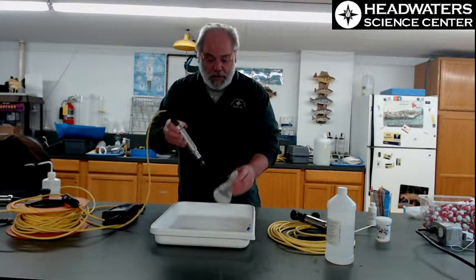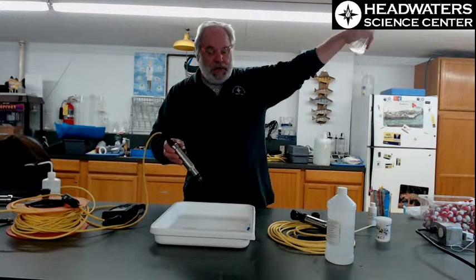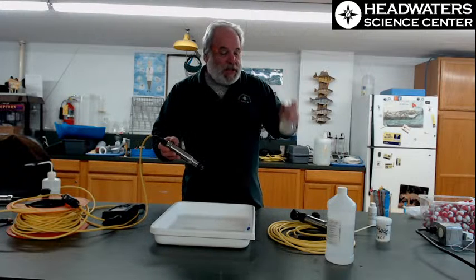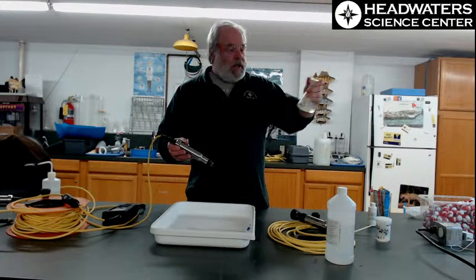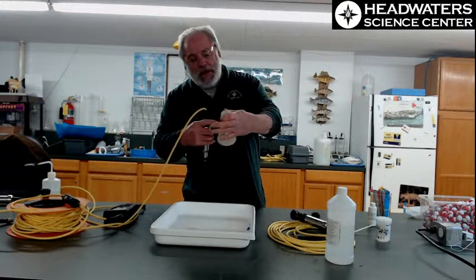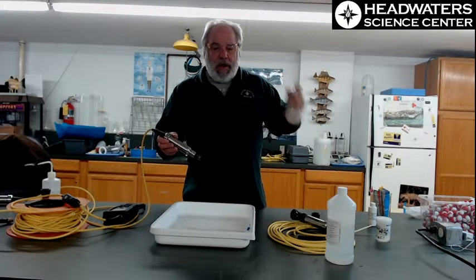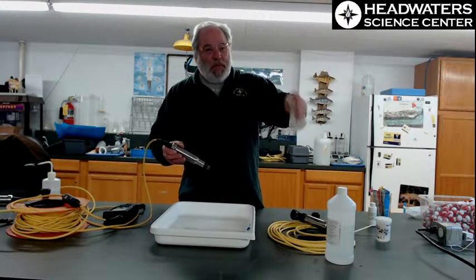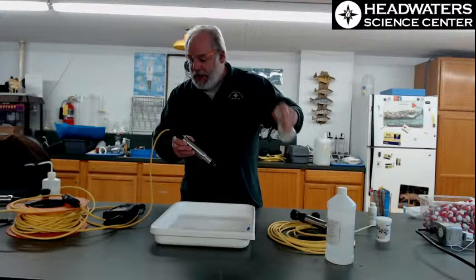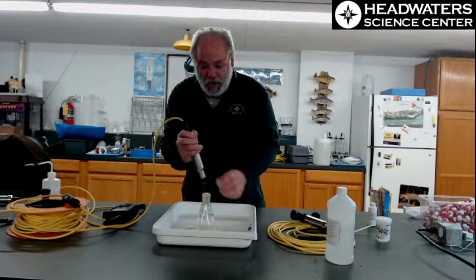Now, what we're going to do is calibrate that in pure water. That's our reagent here. That's water that we've filtered out through our system here. It's deionized, pure H2O. And what I'm doing is I'm shaking it. As you see, this model's almost filled up completely with that liquid. I'm shaking that because what I want to do is create 100% humidity right there. That means it's totally saturated air. So when I shake it like this, it is totally saturated in that area where I'm going to measure, but I'm going to shake it up, shake it up, shake it up. And I always feel like I've got to be quick with this one. So I'm going to get that out there quick and then get that meter in there.